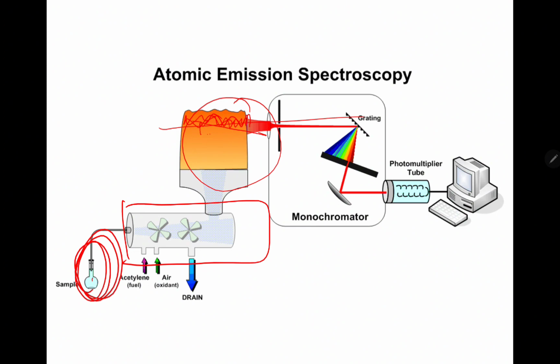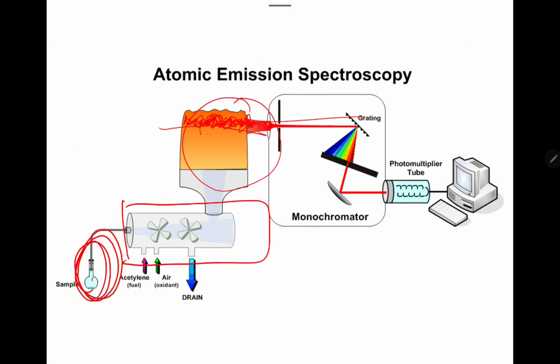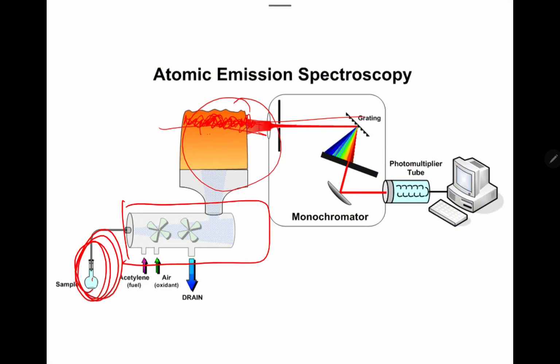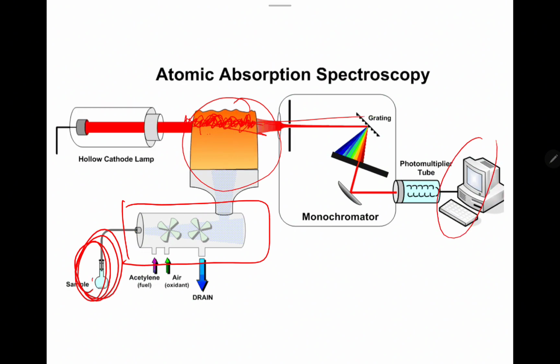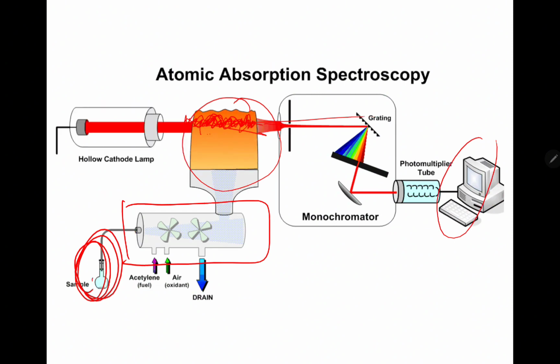Okay? So yung ma-absorb na ilaw na light dito guys will go through the entrance slit. Tuloy-tuloy na siya guys up until your readout device. Okay? So I hope klaro siya, no? Na-gets ninyo ang gusto kong sabihin sa inyo.